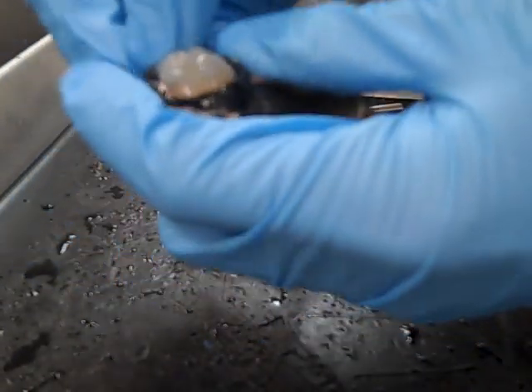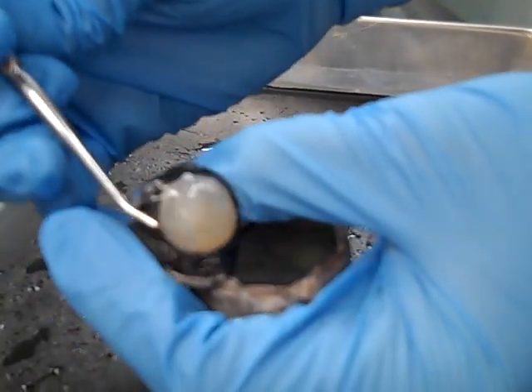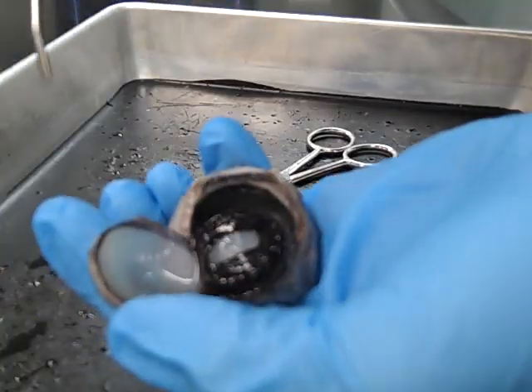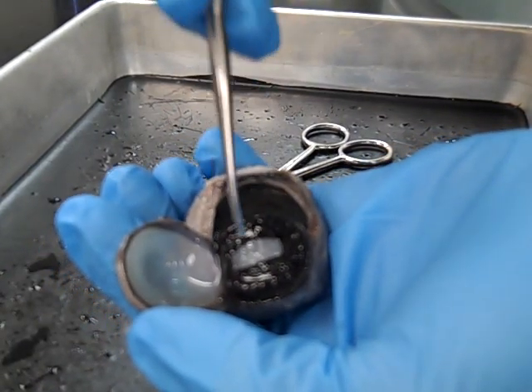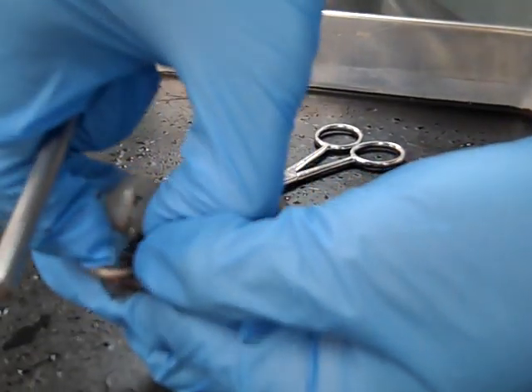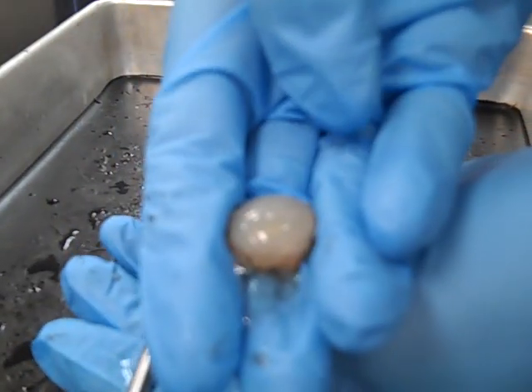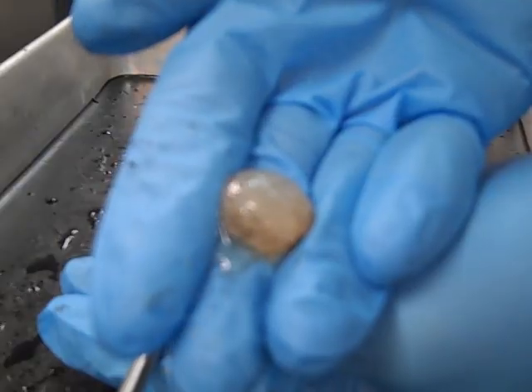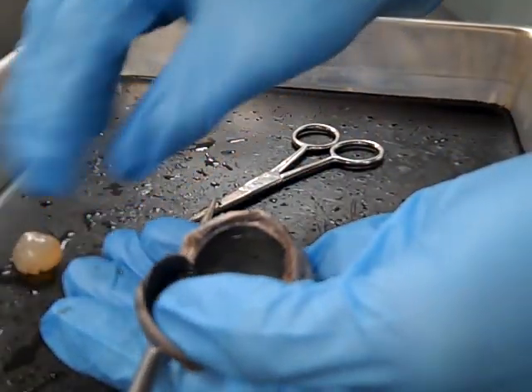We're going to flip this up. Right here, attached to the underside of the cornea, is the iris muscle. That's what this black ring right here is. Right in the middle is the pupil, and right behind that is the lens. Now if this animal were alive, the lens would be extremely flexible, but now that it's preserved it's extremely hard — almost like a marble. Very cool to take a look at.